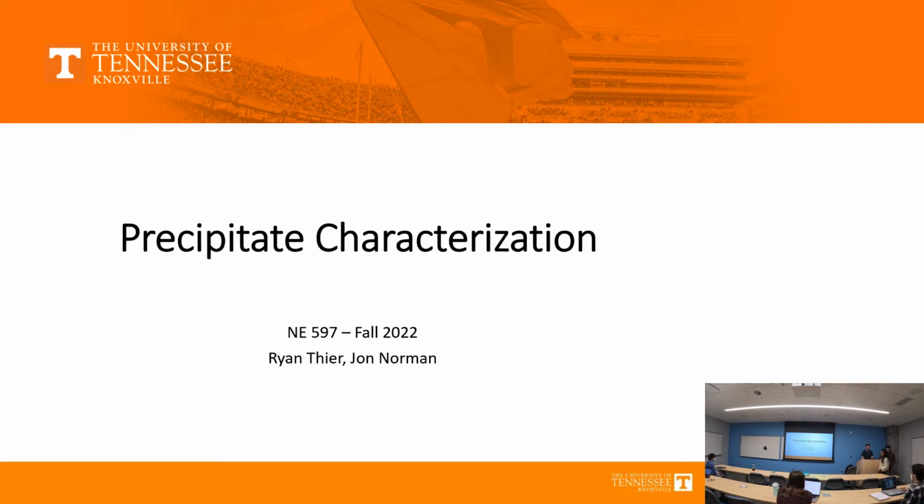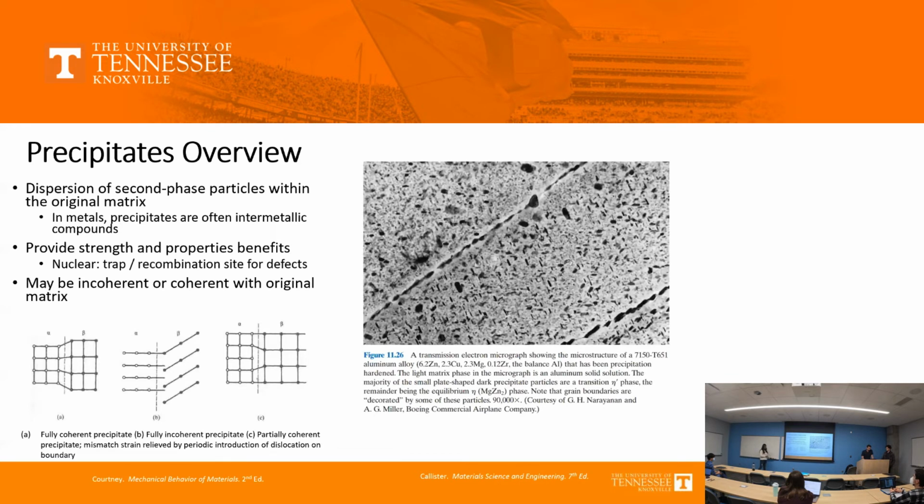As we got everything sorted out, John and I are going to talk about precipitates. So I'm going to focus more on imaging after a brief introduction, and then John will transition more into diffraction techniques. I think starting off, one thing I just want to lead with is that there's really no one-off technique that is perfect. Really, it's using complementary techniques to get the information you need that is the most critical aspect of these. So first of all, what is a precipitate?